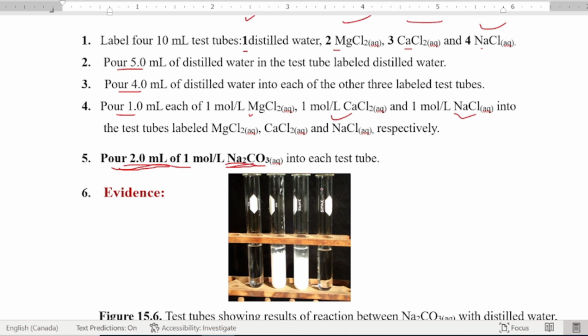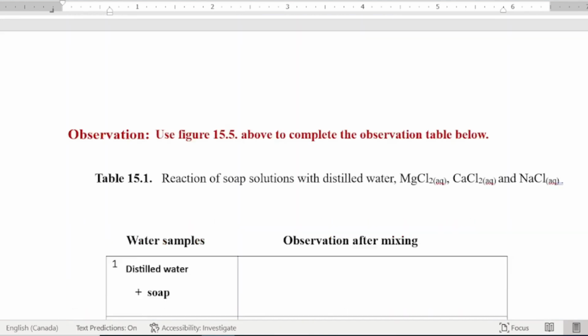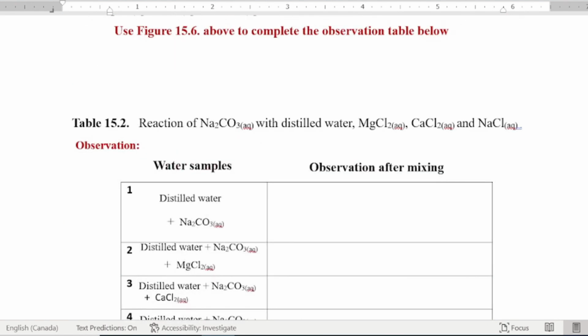We will now use this very set of test tubes here, and we'll pour soap into these and shake up. What do you think will happen now if we pour your 10 drops of soap solution into each of these and shake up? Do you think we'll get the same result like what happened here? You think that, or it'll be different? What do you say? Okay, hold your answer and see what is going to happen now.